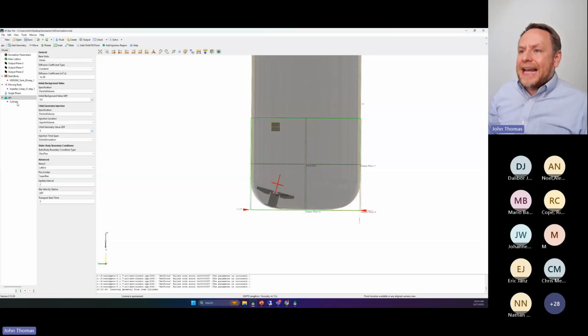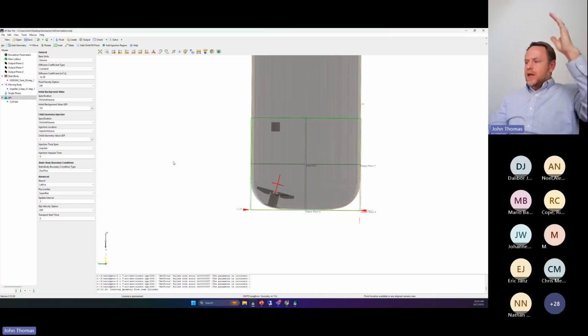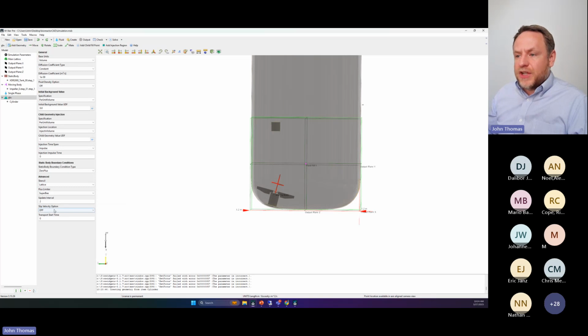And I'll go ahead and add it to the cylinder here. I'll say there's nothing in the background. We'll use base units of volume. We'll do volume fraction representation. And we'll say within this child, at time zero, we'll just pulse it at time zero. At the time we turn on the impeller, we'll add this bolus of glucose. And let's watch it blend.